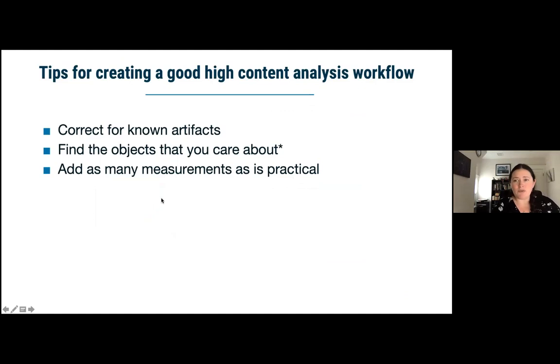And there's really only three things you need to do when you're creating a good high content analysis workflow. The first is, if you know that there are artifacts, things like your microscope needing to be flat field corrected, or if you know that there are things like debris, do whatever you can to get rid of those. Find the objects that you care about, and this is the hard part, and then add as many measurements as is practical. You might not agree with this bullet point yet, but hopefully by the end of the talk, I will have convinced you.